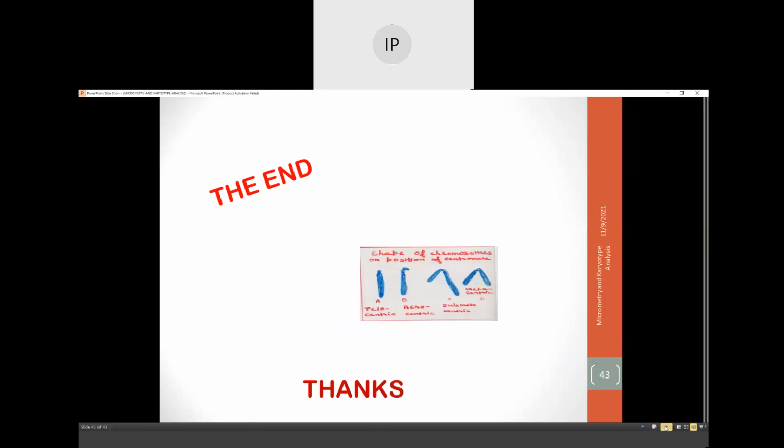Now with this, I have explained about the karyotype analysis and micrometry, and I would like to add two more slides on how to measure.